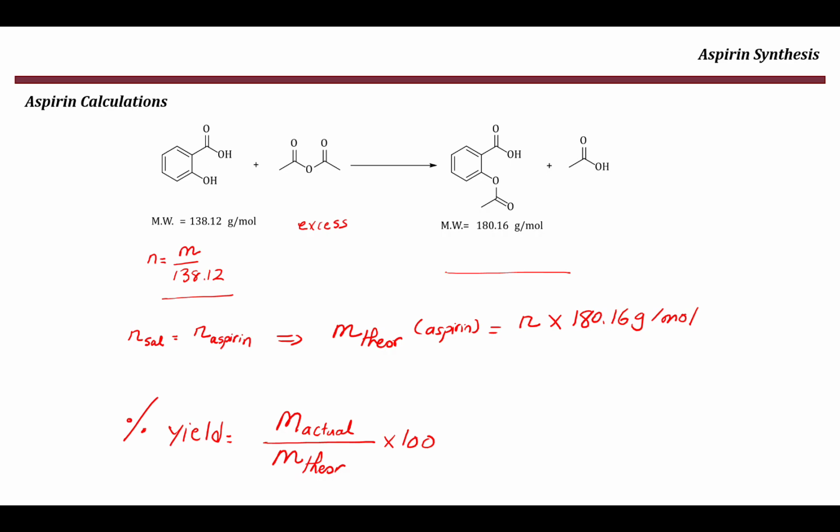Of course, we have to make sure that our aspirin is dry. It doesn't contain a solvent, otherwise the mass could be very high, and this is due to the presence of a solvent.